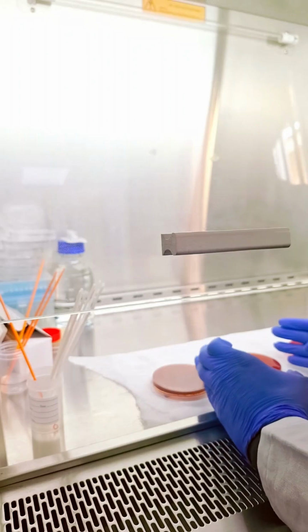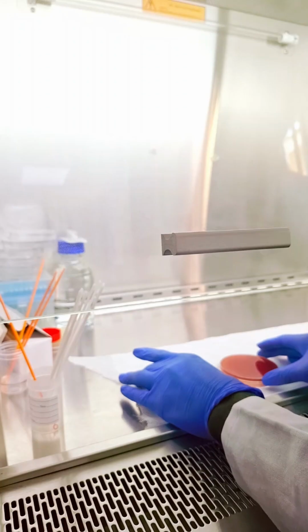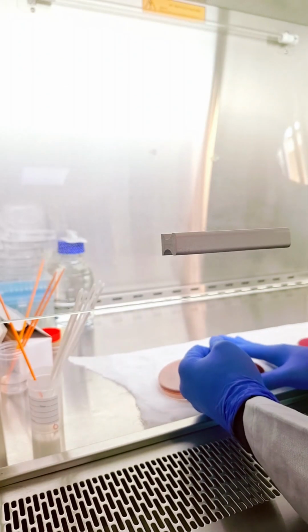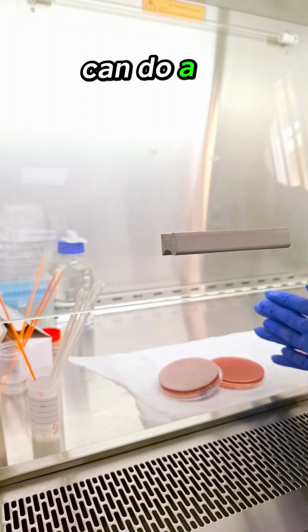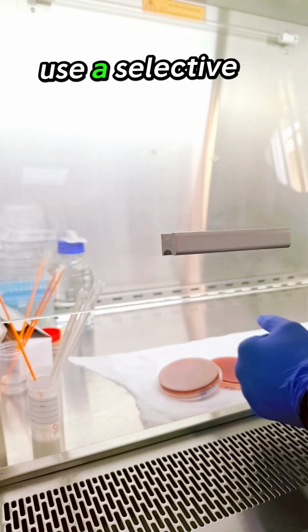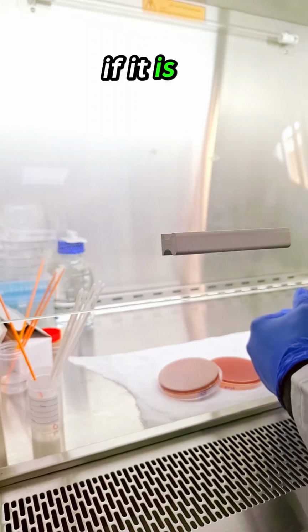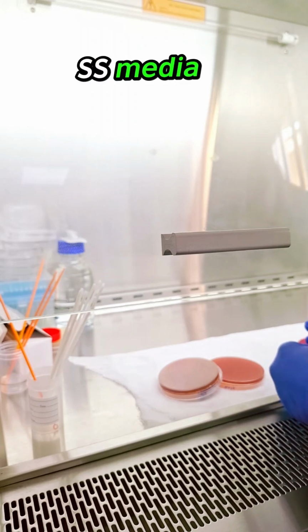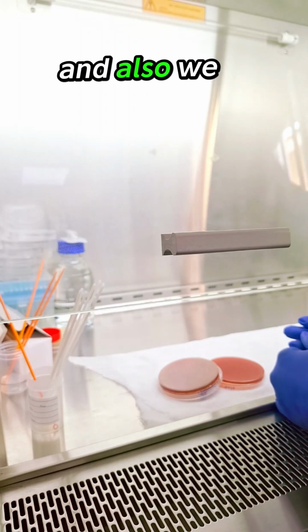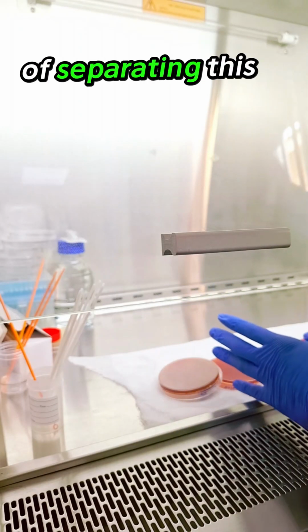There are different methods that can be used to separate these colonies from a mixed growth to a pure culture. Of course, you can use the serial dilution method. You can use a selective media, such as, for enterobacteria, the SS media, Salmonella Shigella media. You can also use the CLED media, which is also a selective media. We have different types of selective media, so you can use them as a way of separating this mixed culture.